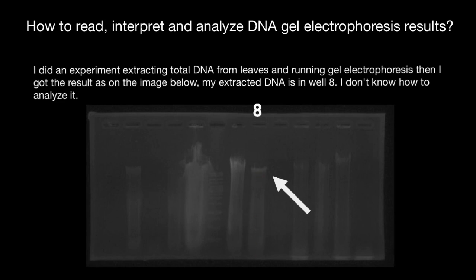The contamination has run faster than the band of interest. We also see that the band of high molecular weight DNA has moved quite a long way from the well. This, combined with a smear of DNA and RNA at lower molecular weight, indicates that there is quite a lot of degradation of your DNA sample.